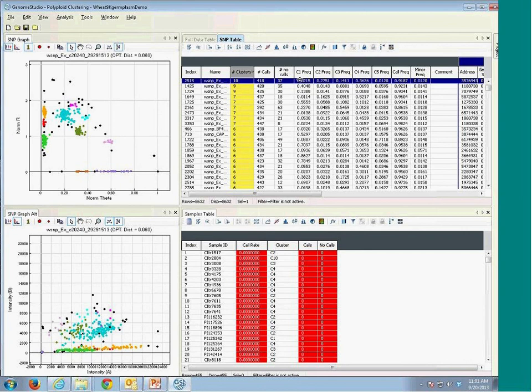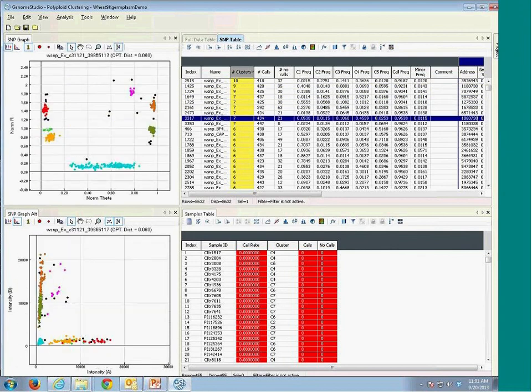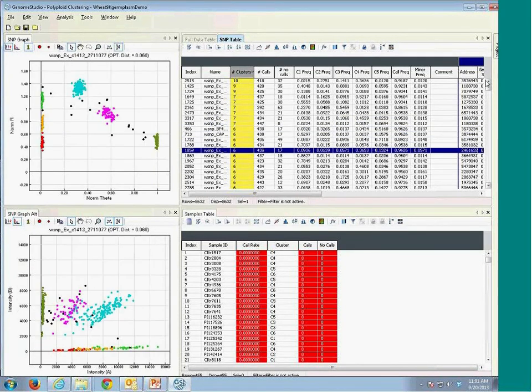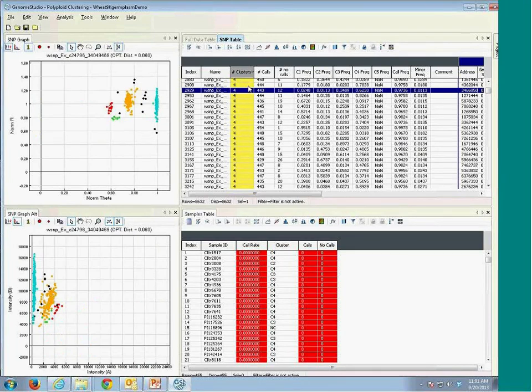Anything giving me 3 or more clusters, I would like to see exactly what's going on. For instance, in this case, this is a pretty complicated pattern, so in most cases I would probably ignore them anyway. Let's take a look at the ones that are showing 4 clusters. In this case, I think those could probably belong to the same cluster.